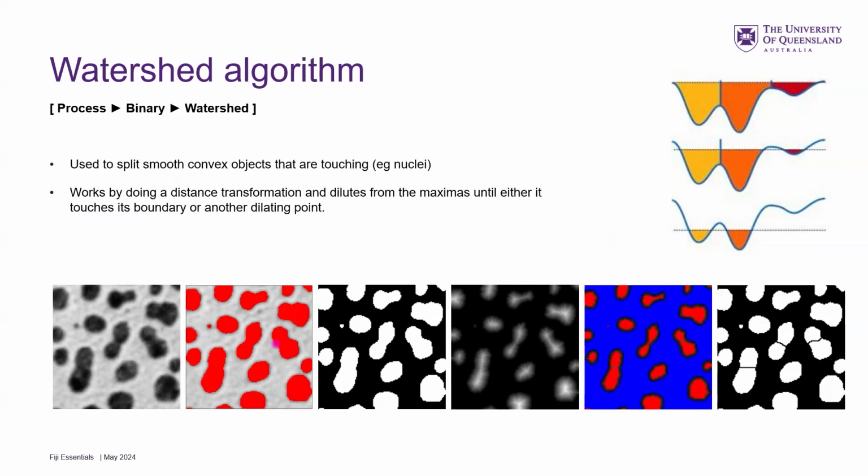So when we threshold it, it looks like this. So we use this watershedding, which is similar to watersheds on the side of a hill. And so we do these expansions and dilations to see when we fill up the different well points and find the midpoint, and then it can cut them, right? So that's a useful tool if you're looking at, say, nuclei and you just want to separate them all.